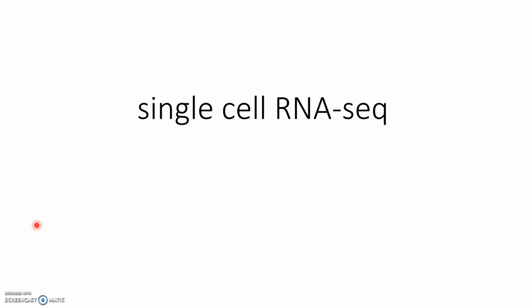And so now we're going to go from our bulk RNA sequencing activity or looking at microarray data to what I consider the new frontier of RNA sequencing and NGS analysis, which is this concept of now being able to quantify gene expression in a single cell.